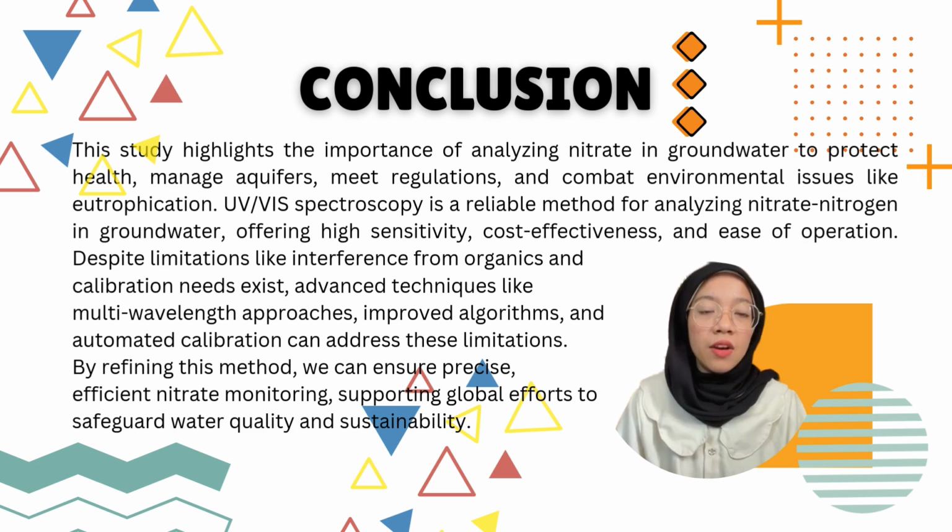While challenges such as organic interference and calibration needs remain, advancements like multi-wavelength approaches, enhanced algorithms, and automatic calibration systems offer promising solutions. By refining and optimizing these methods, we can ensure precise and efficient monitoring, contributing to global efforts to protect water quality, public health, and environmental sustainability.